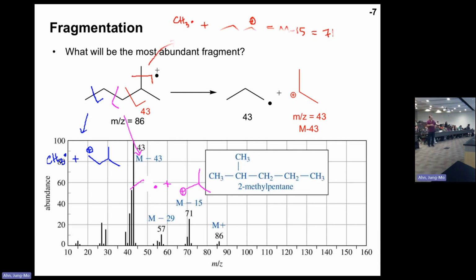Yeah. There's another methyl group there. You've got to look at the structure as a whole thing. See that methyl? If you take it out, if you click the methyl groups out, that also makes a secondary carbocation. So this is not the only methyl group you can take out. You can take out that one, make this one. That's the same thing as the other one.